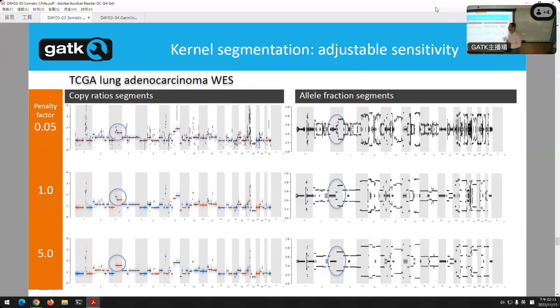Again, we're on to tens of thousands of intervals, so it's a very quick process. Plot it, and if you see something that looks like it has bad resolution, increase it a little bit. That's the way to do it. And I wouldn't recommend starting with 0.05 necessarily. We're just showing you what it looks like at that ratio. I don't remember what the default is, but you'd start with the default and increase it as you need. Now, you wouldn't just start at 5 necessarily, because it means you might miss smaller events. So that's why you don't do that. Getting the balance right is the point. Usually the default option is the right one. Good? Okay. Other questions?